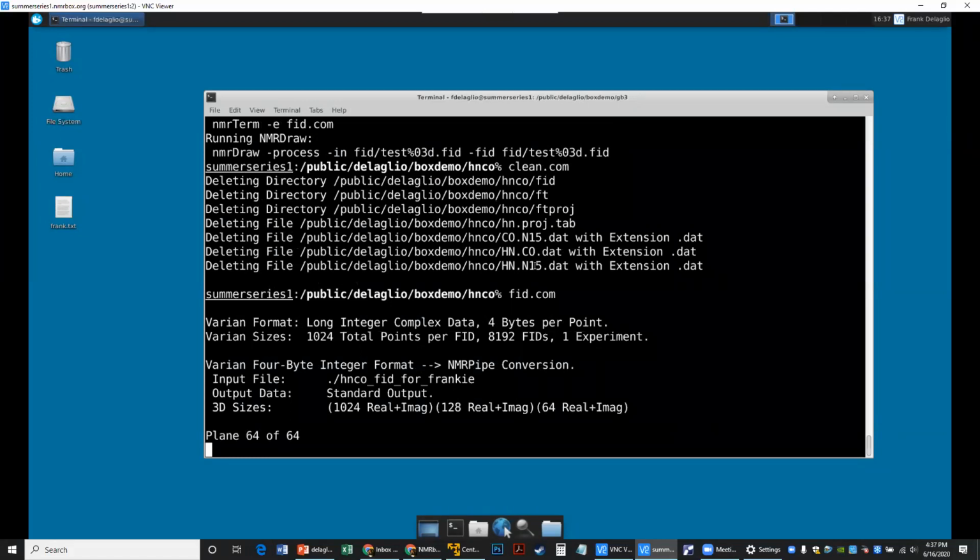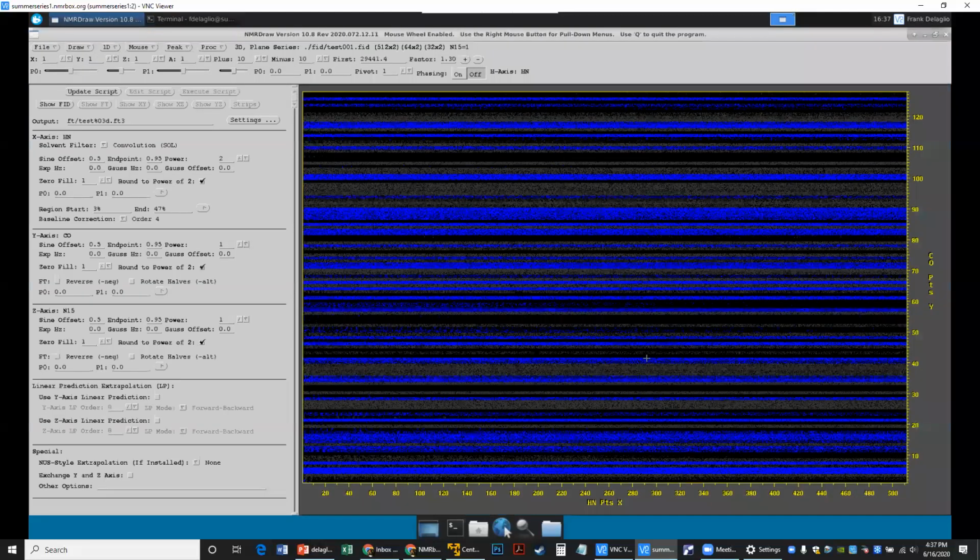Before you did the phase correction by hand. Now, is there a rule or a theoretical rationale for where the pivot should be relative to the offset of that particular axis? Okay, now I understand. Thank you for being patient and explaining it to me.